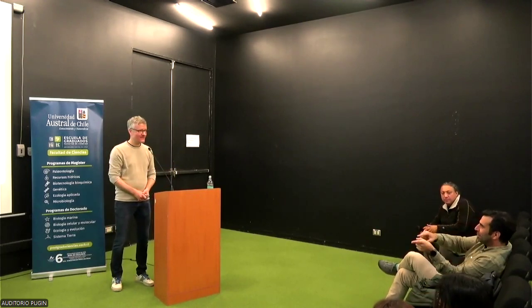But what happens with someone that wants to reproduce what I'm doing? Then they probably have to ask you, please give me your model and let me take a look at it. And therefore, we actually have that cloud service where you can exchange the models. Exactly, this is accessible. The cloud solution was an idea from our foundation where everybody could access it for free. And now I think you have to pay some money depending on how many gigabytes you need to use. But that's really the idea, to exchange the data and the scripts to really prove whether your data plots are true or not.